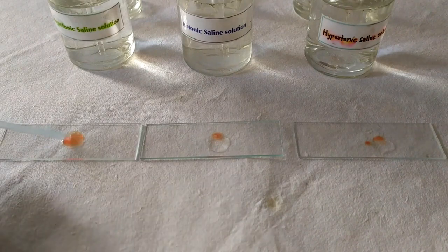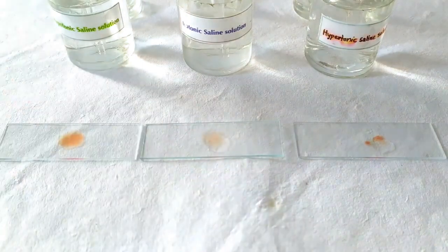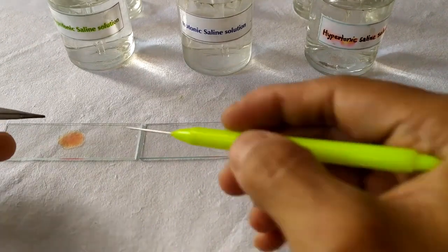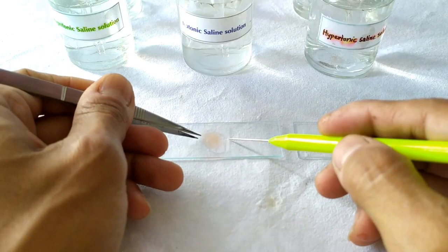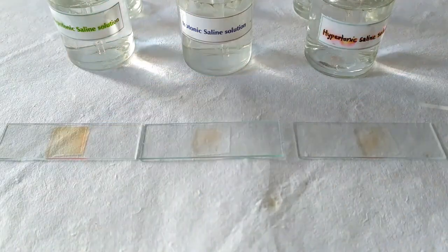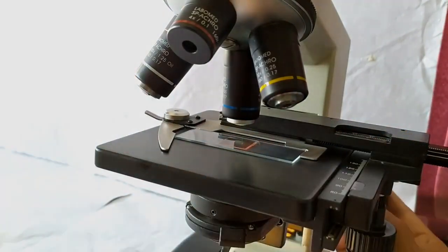Mix each drop of blood and tonic solution using 3 different mixing sticks or toothpicks. Cover them one by one using cover slips. Allow the slides to stand for a few minutes. Observe each slide under the microscope.